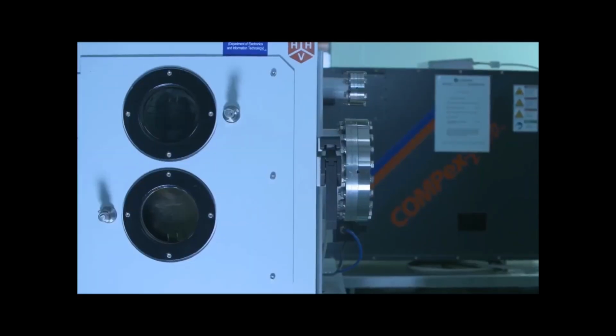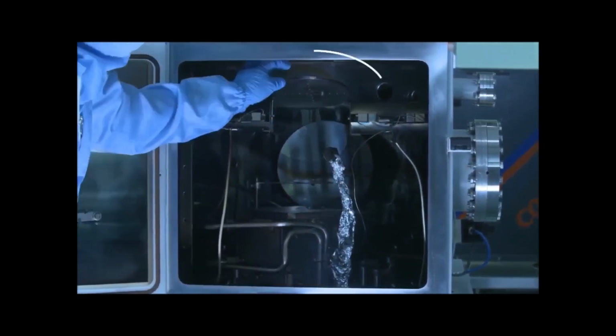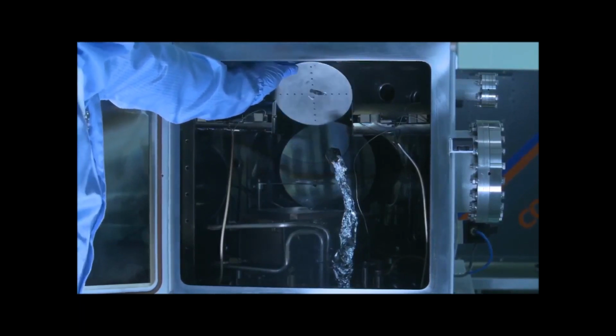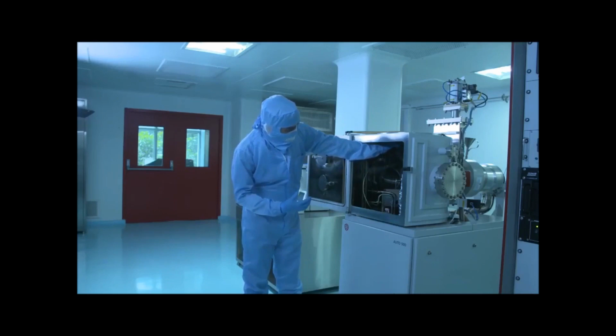Now let's open the deposition chamber. This is our deposition chamber, and inside it, as you see, the first part is the substrate holder, and this substrate holder can hold samples of different shapes and sizes. This substrate holder can rotate 360 degrees, so it can let us deposit at a particular angle.